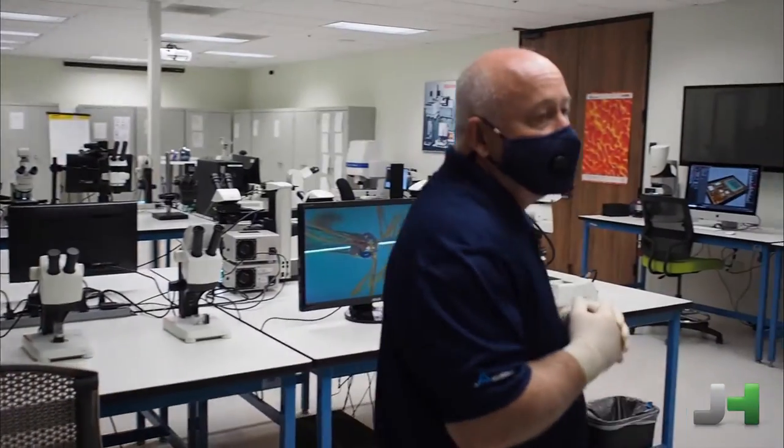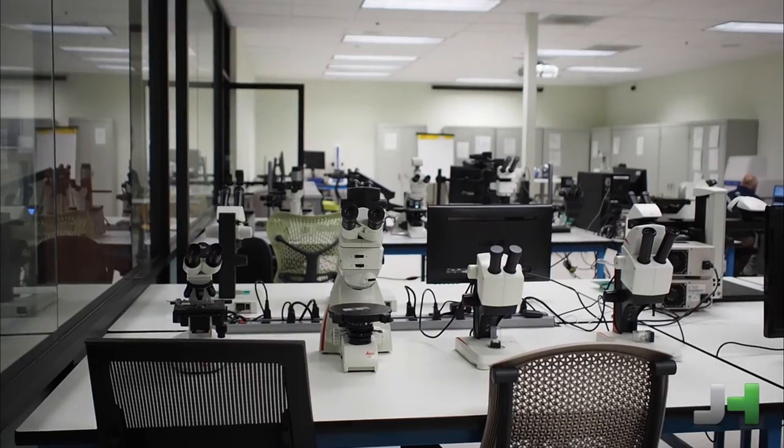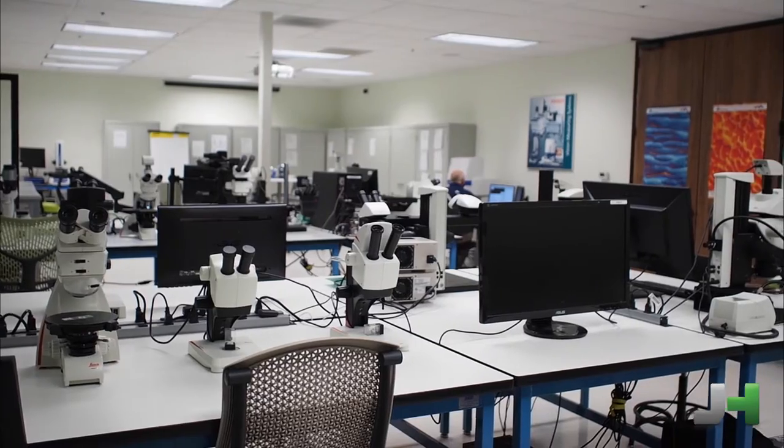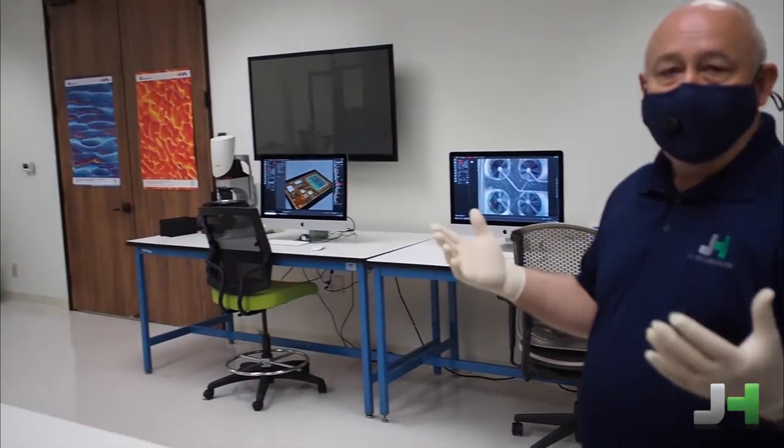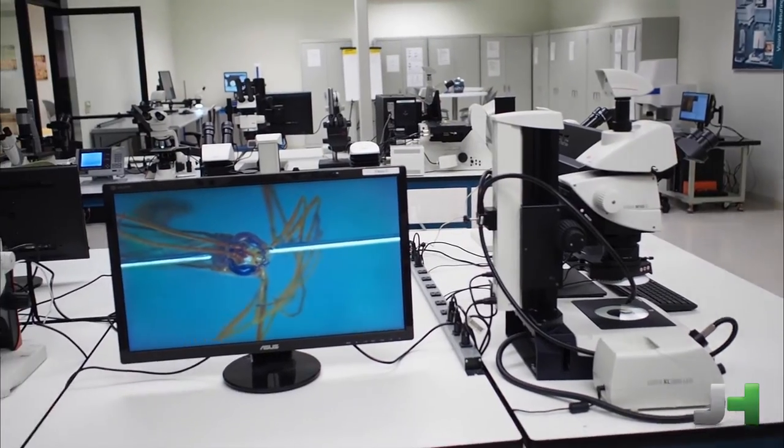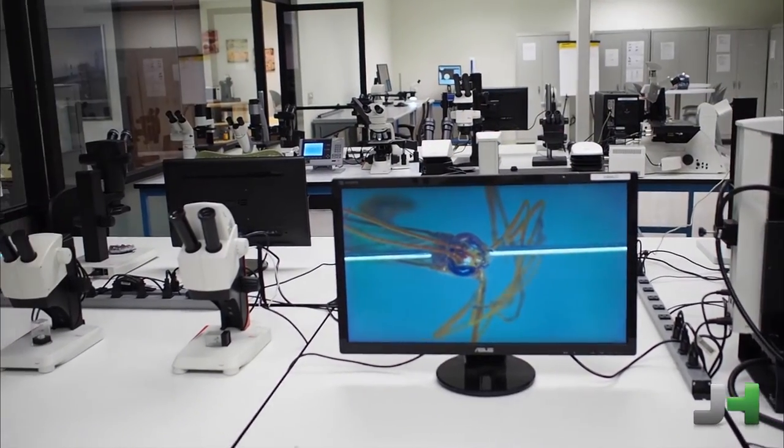Next place we go into is our main demonstration facility. This is our showroom. Inside of our showroom, we carry essentially the entire product line from Leica for industrial microscopy. We'll give you a little bit of background on all of these tools.